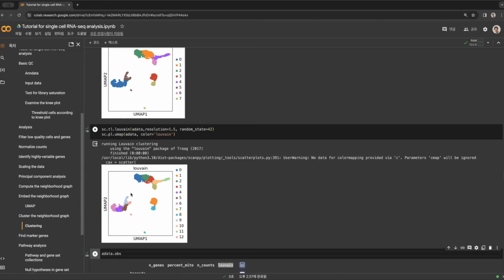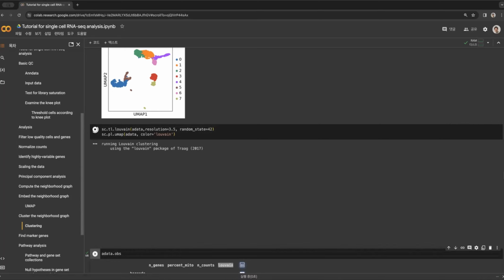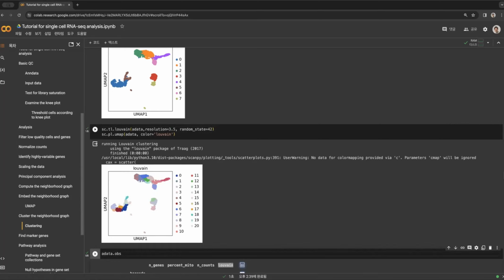This is not really like two different binary distinctions, right? So you see that these large clusters can divide into 3, but even those can divide further, right? See, you can see further.